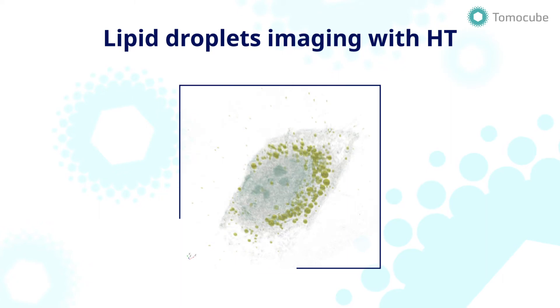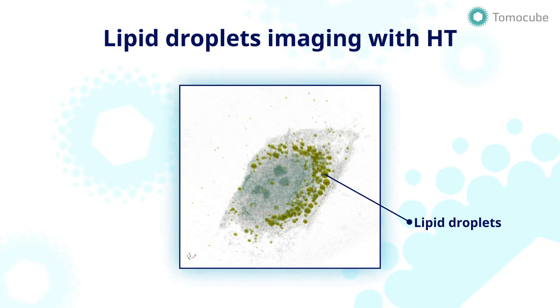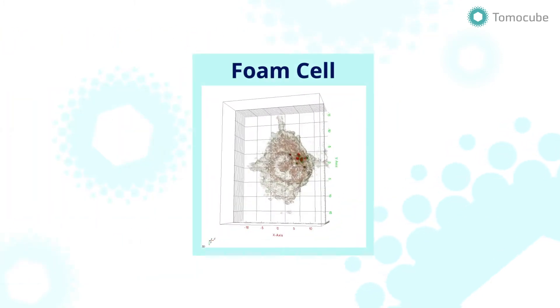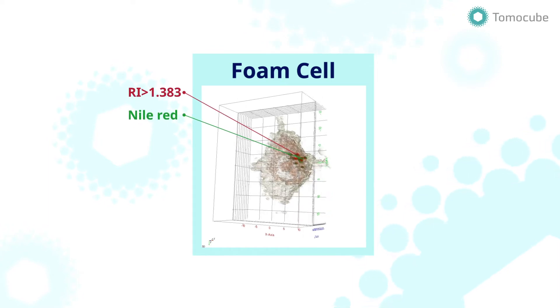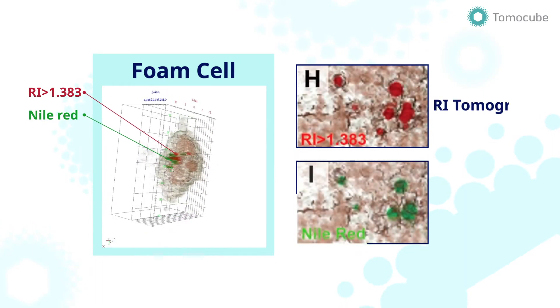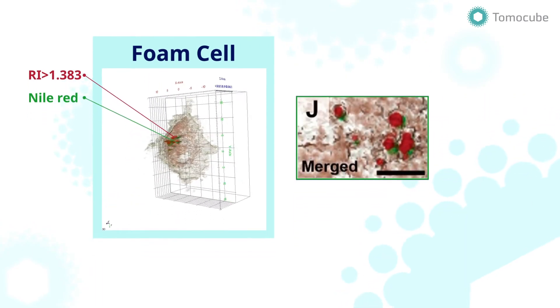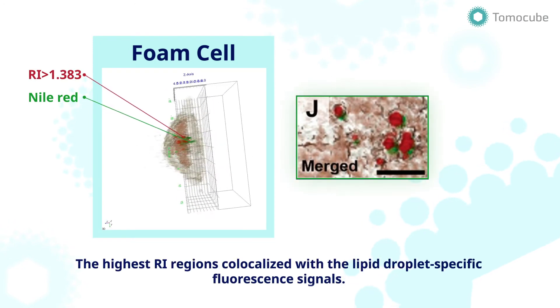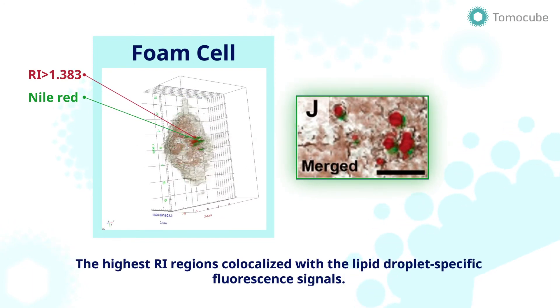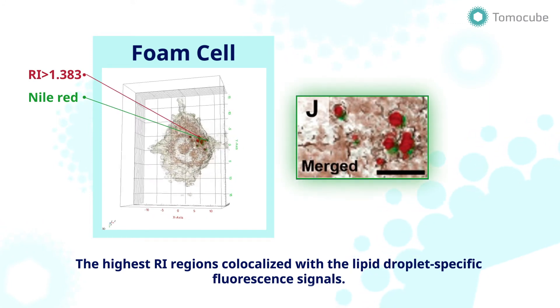By using the 3D refractive index tomogram acquired by HT, it is possible to clearly distinguish the lipid droplets from the surrounding cellular content. The research team successfully captured lipid droplets in live foam cells using correlative HT and fluorescence microscopy. They confirmed that the area with high refractive index marked in red and the area stained with lipid-specific fluorescence dye were an exact match. Thus, they were able to show that holotomography can be appropriately used to identify lipid droplets in live cells without using any labels.